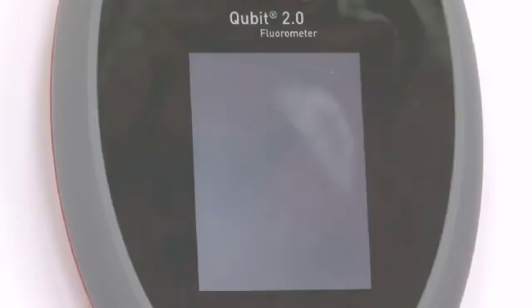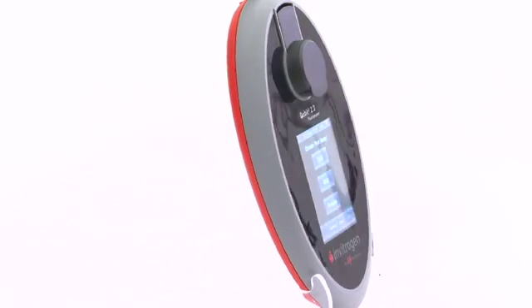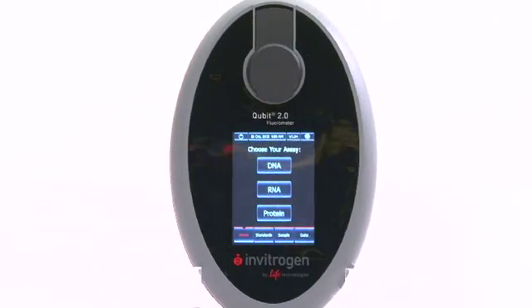The Qubit 2.0 is not just a new product — it's way more than that. And yet thousands and thousands of users will instantly know how to use it. Performance with simplicity — this is the very DNA of Life Technologies. Qubit Fluorometric Quantitation: sensitive, specific, affordable. Simply better than UV.